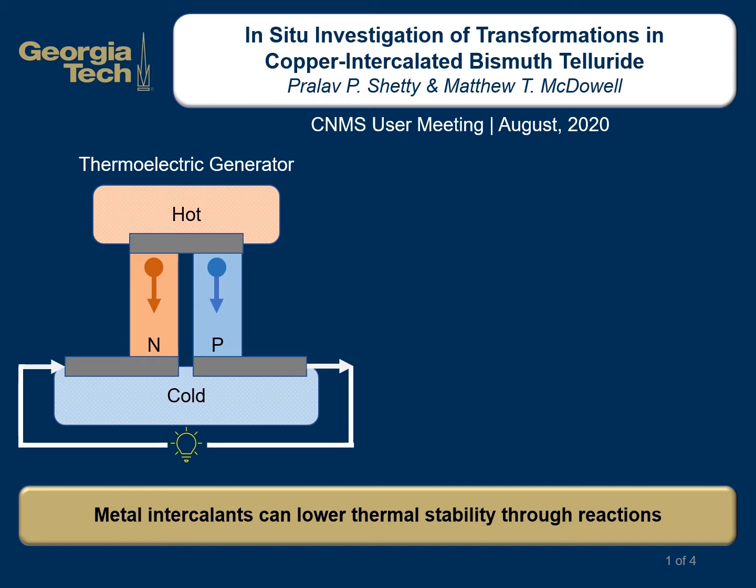Today I'm going to tell you about my work on the in situ investigation of transformations in copper-intercalated bismuth telluride. Bismuth telluride is a thermoelectric material. It can be used to make several interesting devices like this thermoelectric generator shown here.